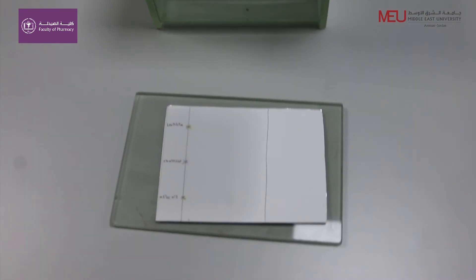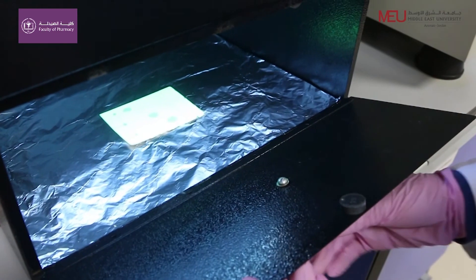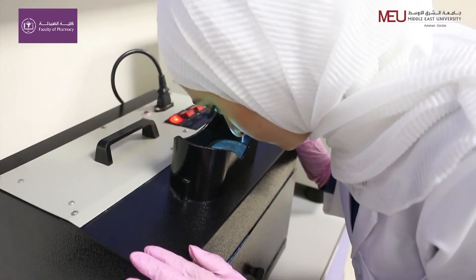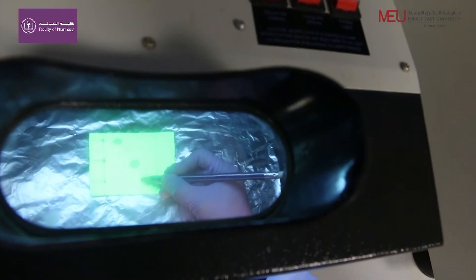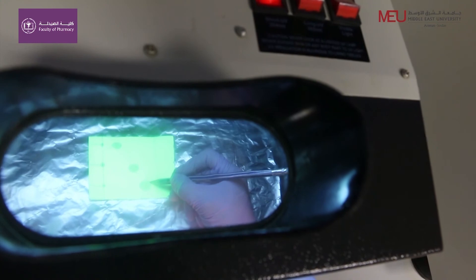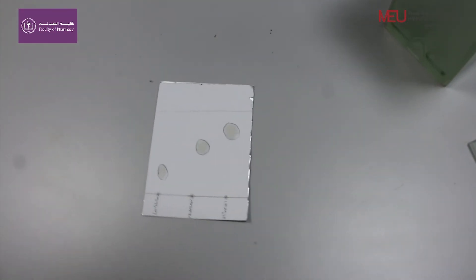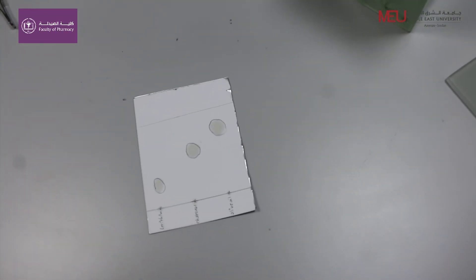Using a UV lamp, visualize the spots. Draw gently around each spot. You may now determine the RF values of your compounds.